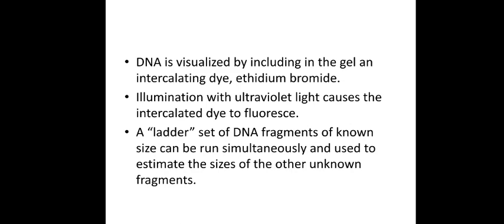Depending upon the solvent distance and the chemical that is moved, you are going to get that RF value. In the same way here too, you can compare the known fragments of DNA with the unknown fragments of DNA. You can identify the DNA fragment length.